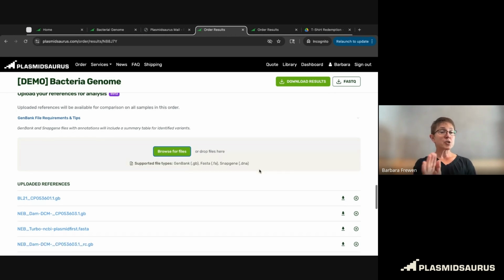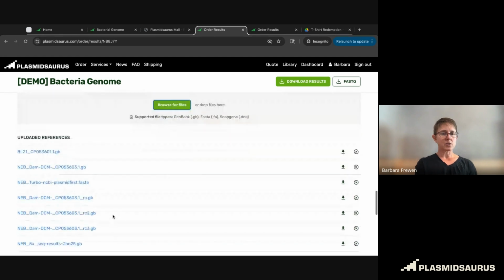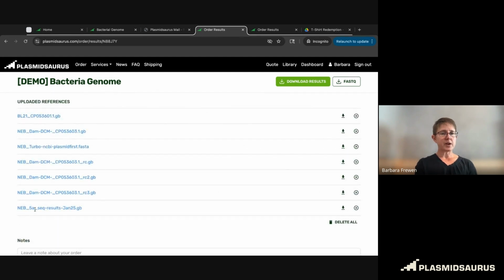However, the person who placed the order is the one who can upload these files. So Matt very kindly uploaded a bunch of files for us. And here's the first one we're going to use. It's called the NEB5A sequencing results January 25.